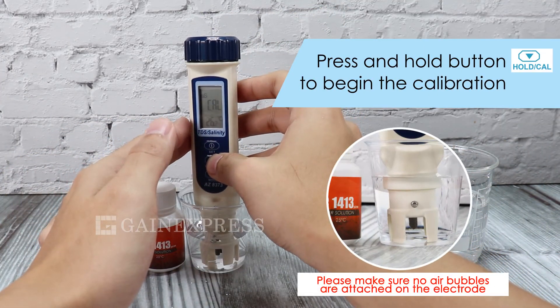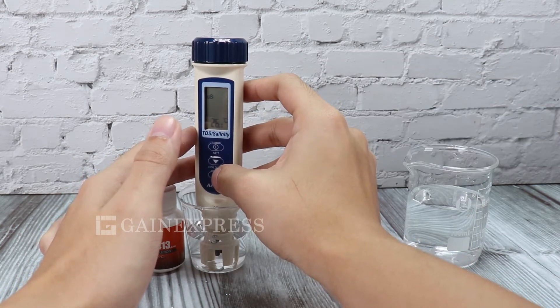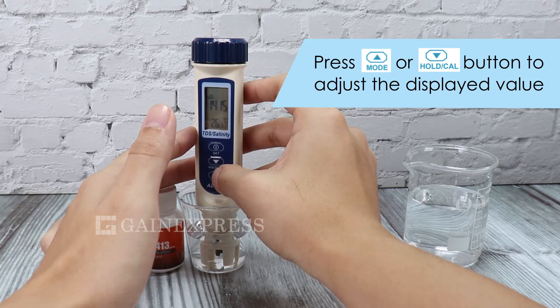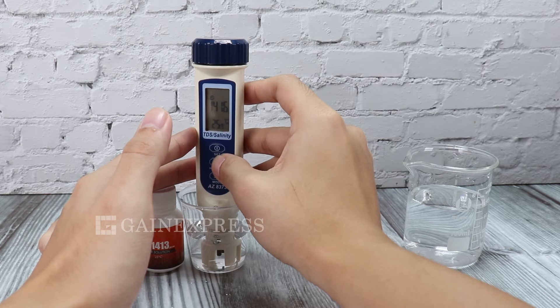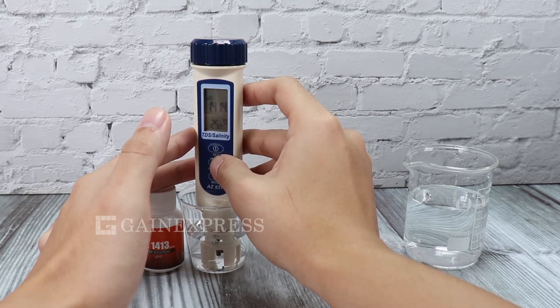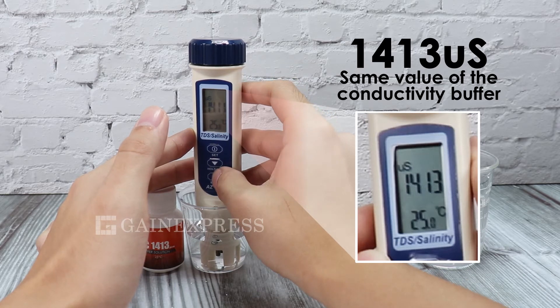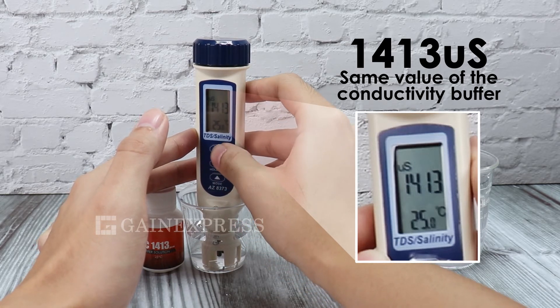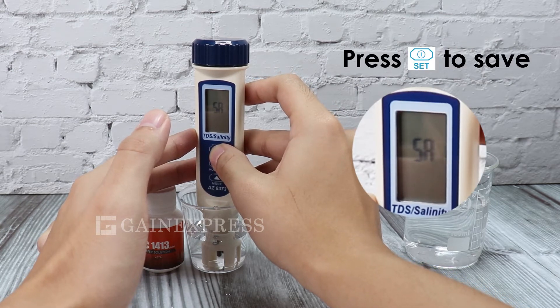Press and hold the NCAL button to begin the calibration. Wait until the display becomes stable. Press the up or down button to adjust the displayed value. Make sure the value is matched to the conductivity buffer, then press the SET button to confirm the value.